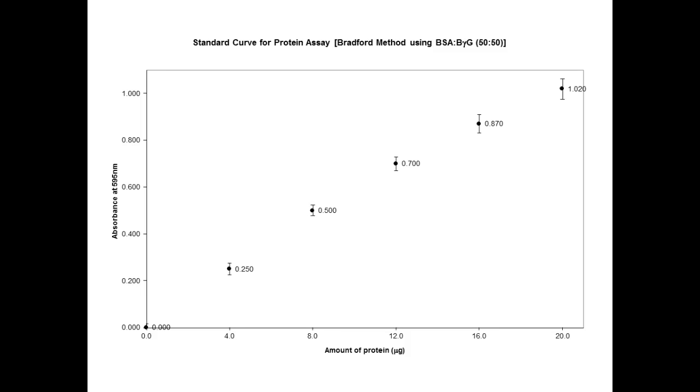We stick the whole plate in, and the machine looks at each well and assigns a number value to each one of those wells based on the color or how cloudy that well is. And so what you have here is a reading from a machine like a spectrophotometer on the absorbance rate at a particular filter color, and then their known amounts of sample. So 4 micrograms of the sample. Can somebody just close that plate for me? And then what the reading came off for that machine.